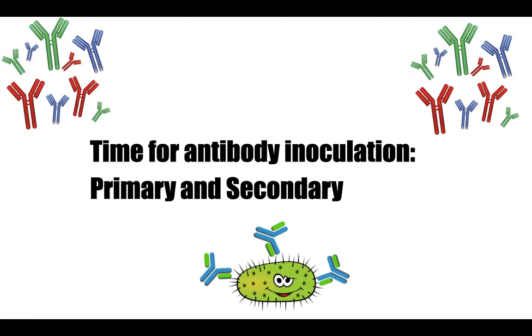This is time for the antibody inoculation, both primary and secondary. Antibodies are used in order to bind to certain proteins of interest. Antibodies are specific to certain proteins, and these are commercially bought. A primary one is used to initially bind to the protein of interest, and a secondary one is used to bind to the primary antibody to ensure its presence. The secondary one is tagged with something to enable the experimenter to see whether the primary one is there.